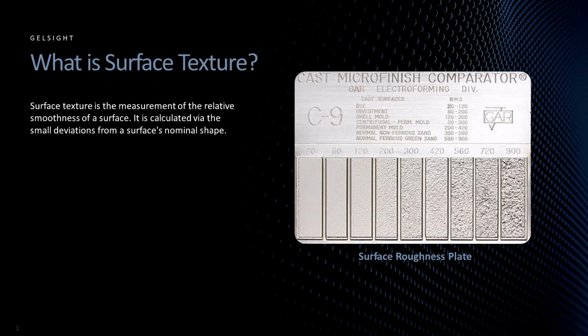texture analysis, I'm going to begin with the very basic question, what is surface texture? Sometimes the surface texture is also referred to as surface finish or even surface topography, and for the most part, these terms can be used interchangeably. Surface roughness, however, is the analysis of a specific bandwidth of wavelengths within the surface texture. I will be talking more about this in a few minutes.